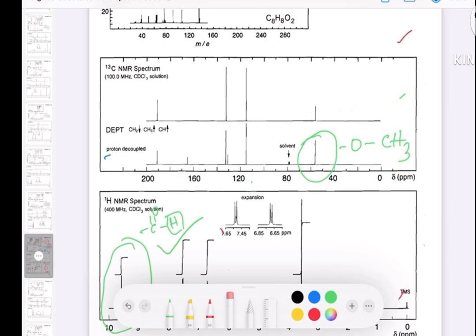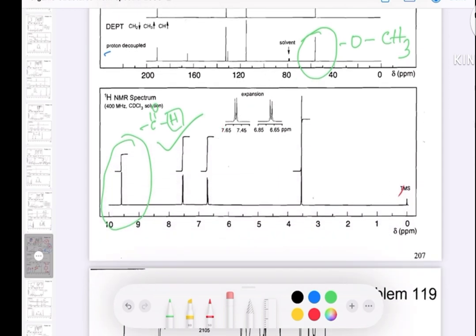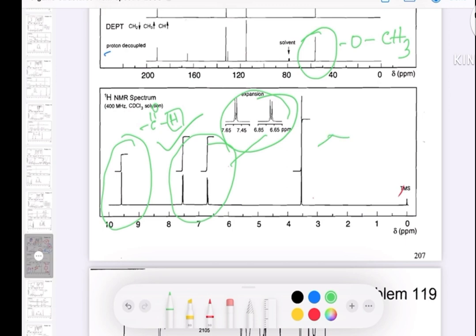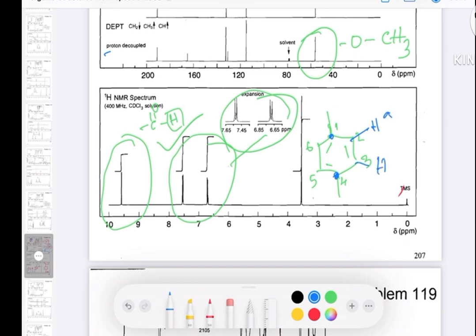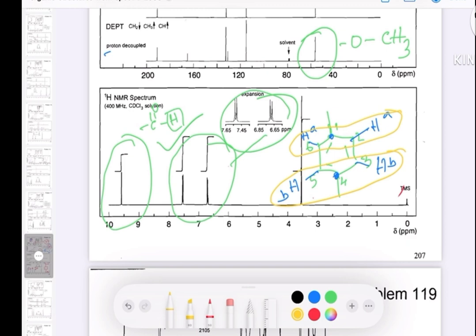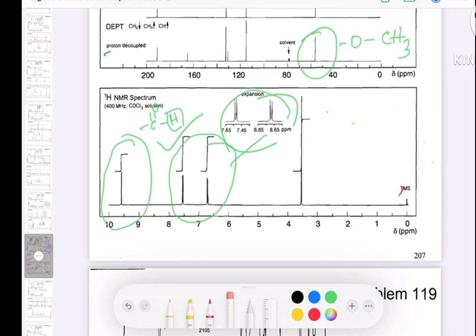An important piece of information from the proton NMR: if you see two doublets in the aromatic region (7 to 8 ppm), that indicates a 1,4-disubstituted benzene ring. As I mentioned in previous videos, when the ring is para-substituted, hydrogens on one side (type A) are equivalent, and hydrogens on the other side (type B) are equivalent, giving you two doublets — each integrating for two protons.